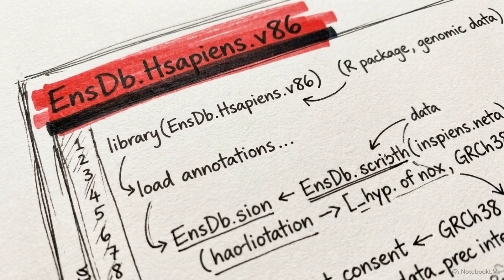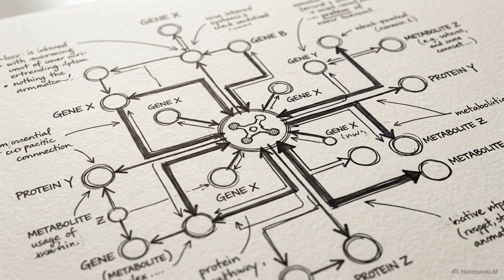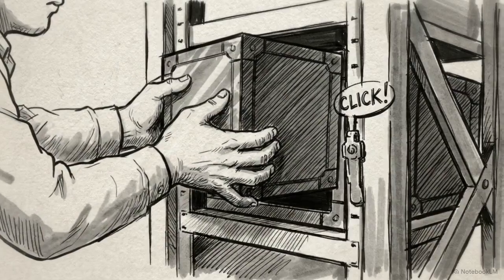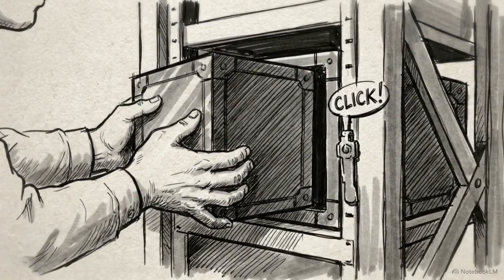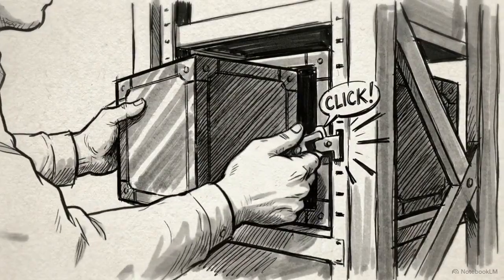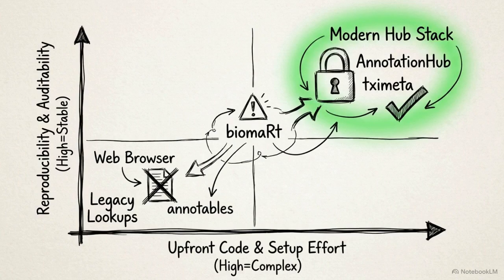By embedding the correct annotation data early, complex downstream steps like gene set enrichment through clusterProfiler run smoothly, accurately cross-referencing between transcript lists and known biological pathways. The extra lines of code you write on day 1 are the exact cost of securing an audit-proof, locally stable infrastructure. This quadrant chart maps our 3 tool families across the reality of a production environment, plotting upfront effort against long-term reproducibility.